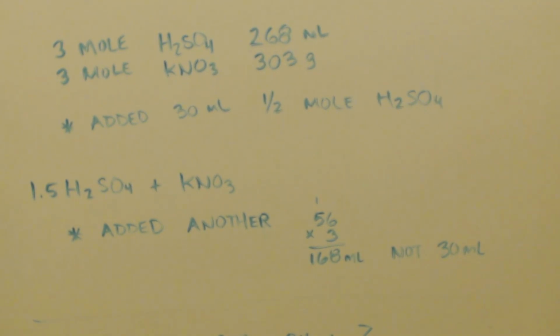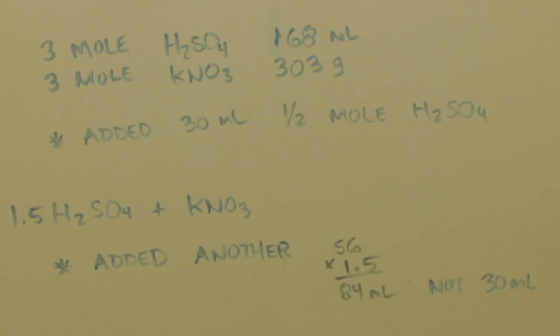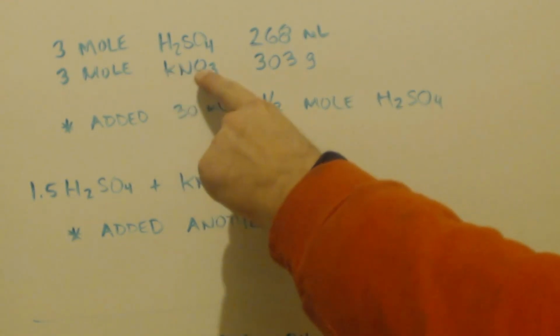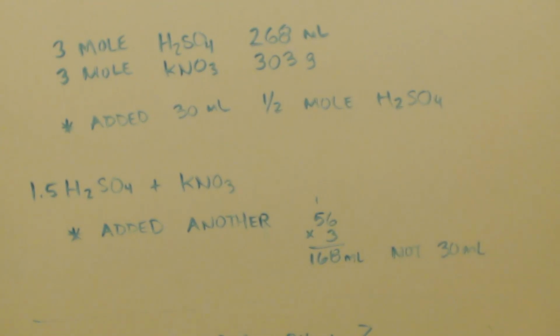I mean, think about it, the sulfuric acid that's left is a tiny bit at the end of the reaction, and the potassium nitrate is a tiny bit there. You know what I mean? They have to touch each other. They can't just be in the same reaction pot. So at the end, if you have a lot of excess sulfuric acid, you have more of a chance for it to find the remaining few molecules of potassium nitrate to give you that higher yield.